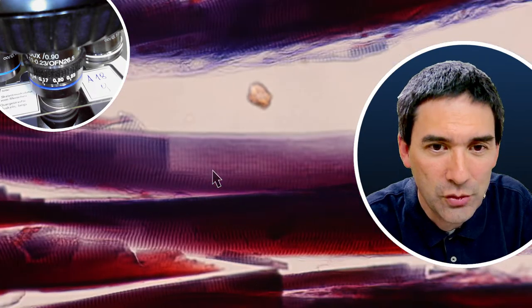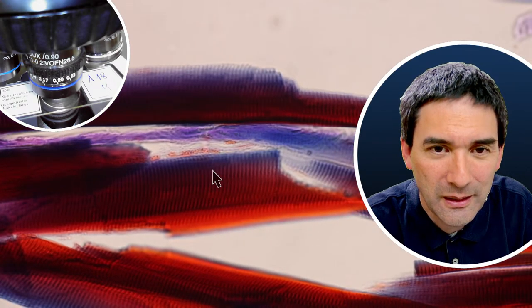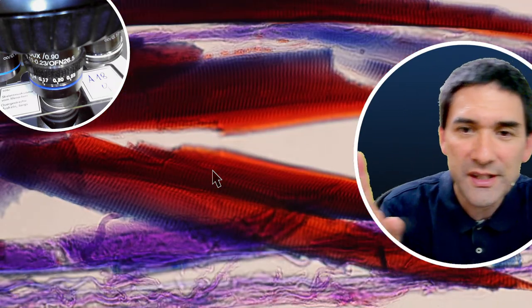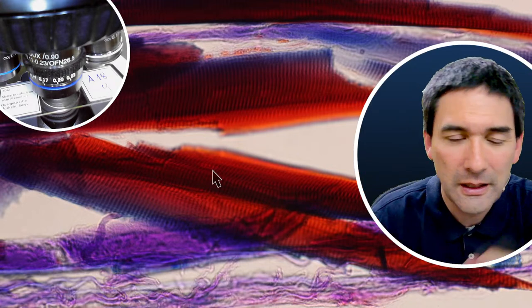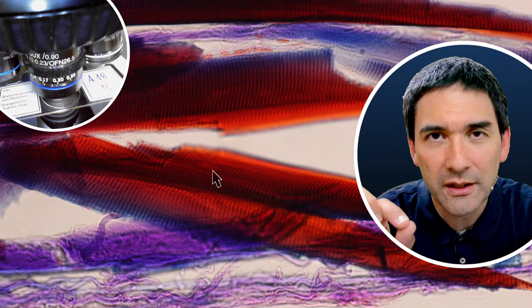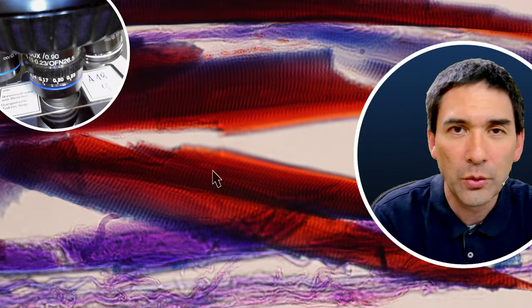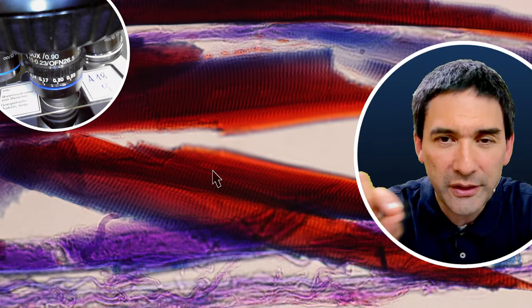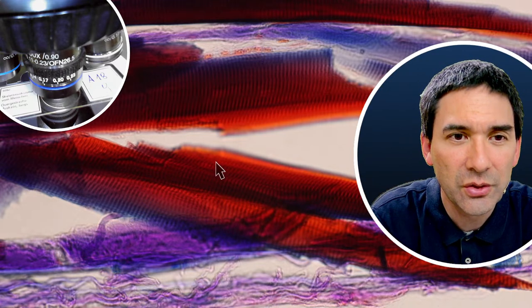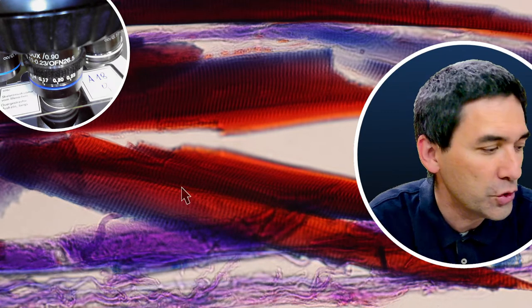And why skeletal muscle is interesting is because, a little bit like a fungus, there are long muscle fibers, which can be around 30 centimeters long, a foot long. Basically, those are long muscle fibers that contain hundreds of nuclei. It's almost like one large, huge cell containing hundreds of nuclei, because the protein fibers that are responsible for contracting run through the whole muscle fiber. And so this means that we're not able to see the individual cells here, because it can be seen as one long structure.